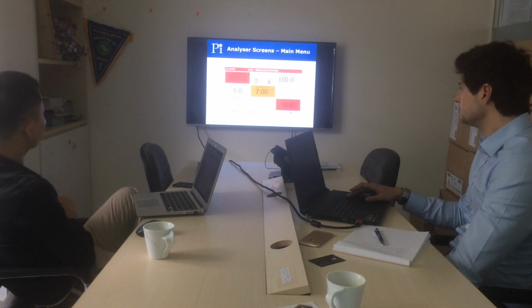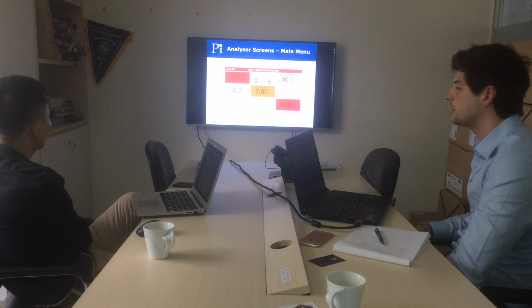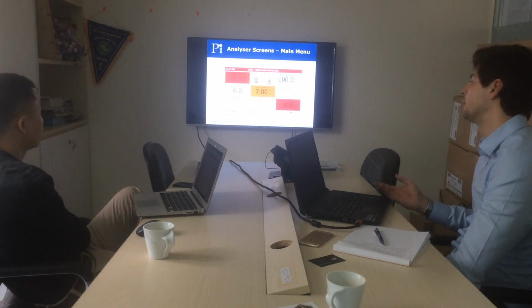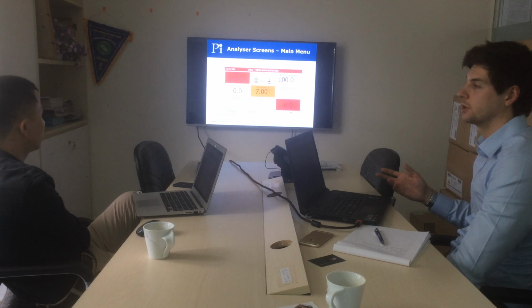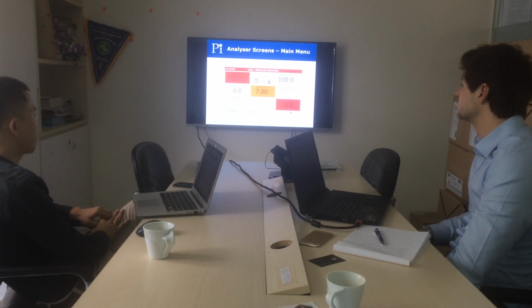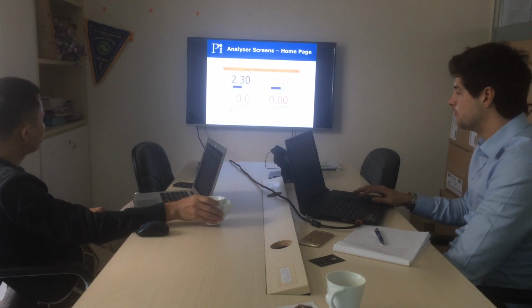In terms of what it looks like on the screen, this is a typical main menu, which you can see is colour coded. Anything in white means that the system's fine. Orange means it's in warning, so maybe it needs a calibration or some maintenance. And red means that there's an error, so maybe the sensor's not connected, or there's some kind of communications error. It can output that signal if you want it to. So it's very easy to see straight away if there's any problem with the analyzer, or if anything needs doing to it.